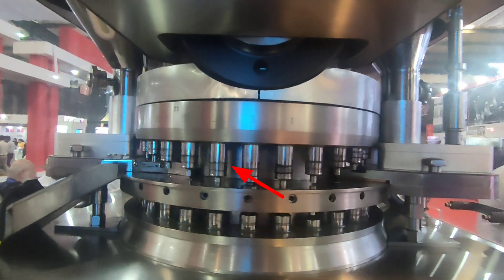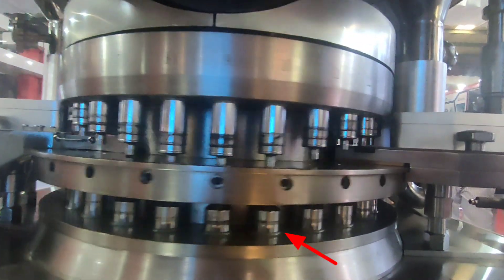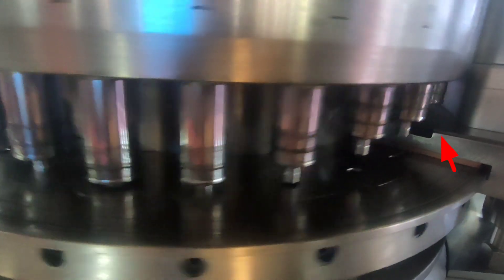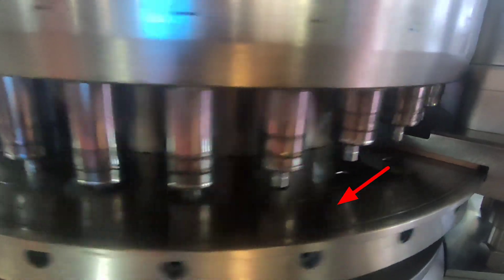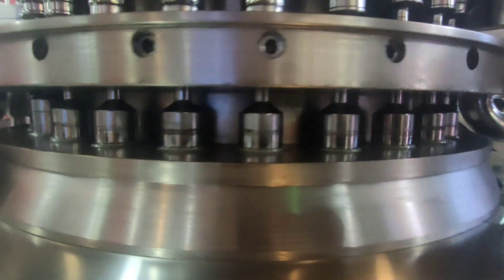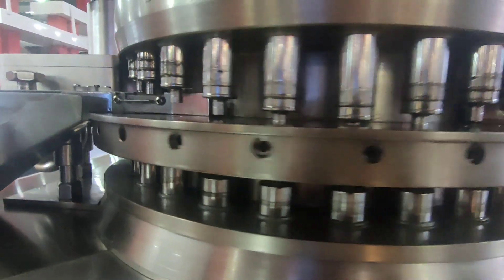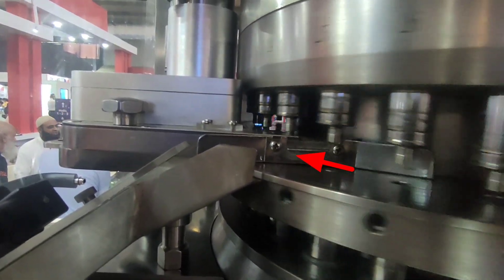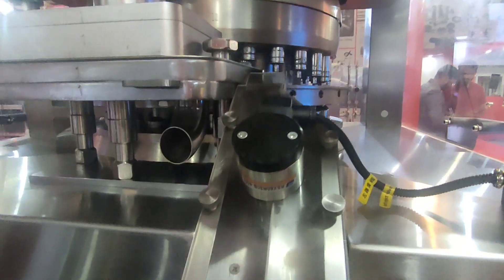These are the upper punches and these are the lower punches. This one is the feeder of the tablet compression machine, and this one is the die table. Here, dies are installed — you can see the cavities where punch tips are inserted, and these are known as die cavities.